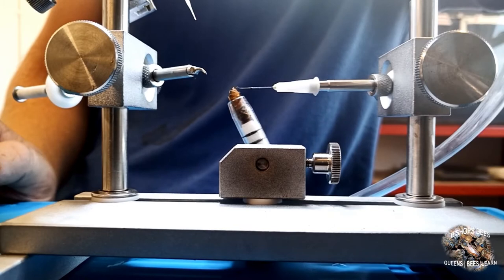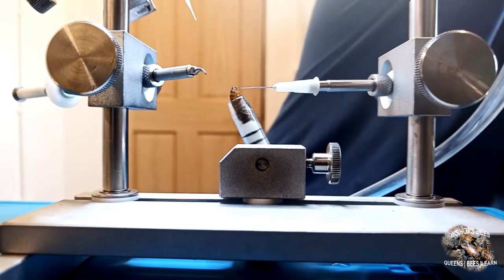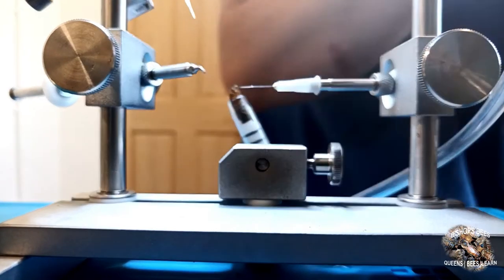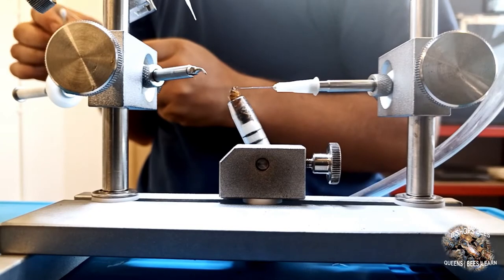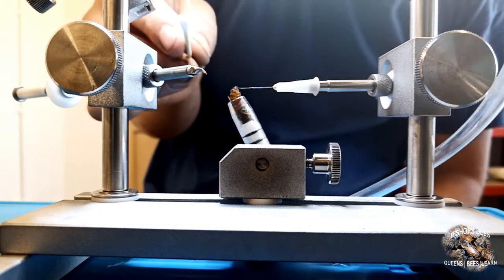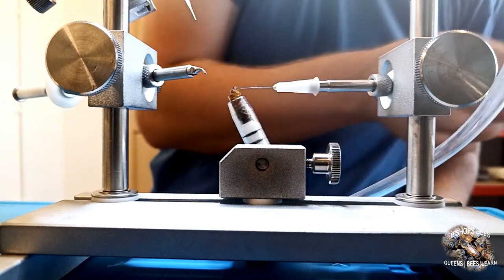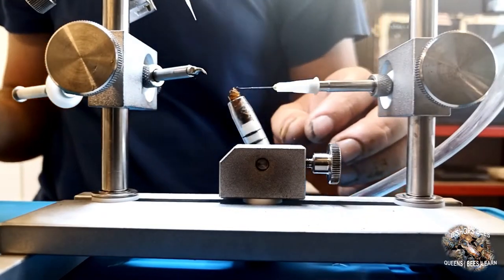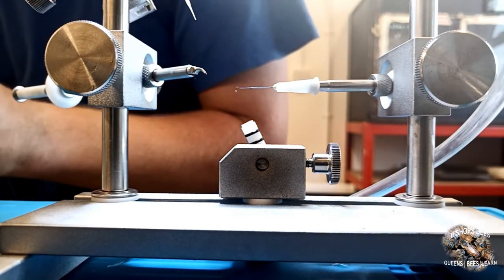If there is any semen on the outside of the insemination tip, it will need cleaning off using a cotton bud and saline. The cotton bud should then be discarded after use. It is important that you do not touch the insemination tip, the ventral hook or the sting forceps during this procedure. The queen is then removed from the CO2 applicator and marked.